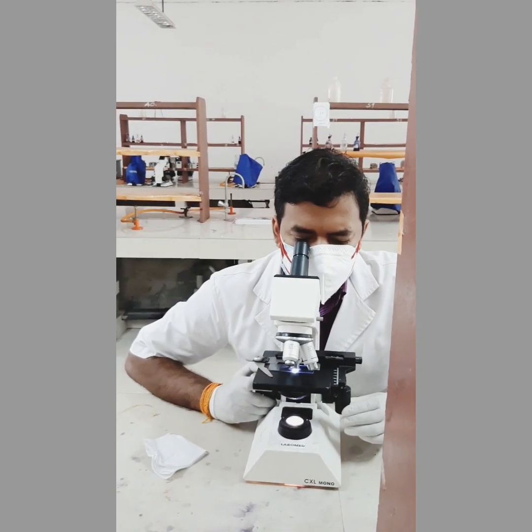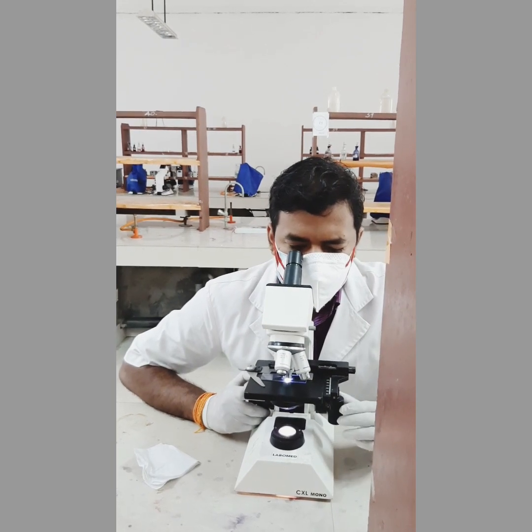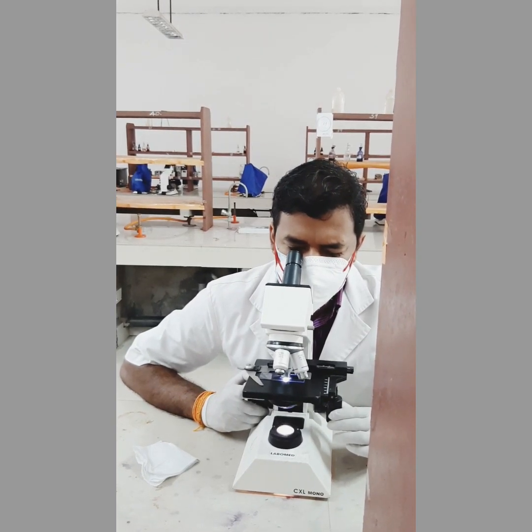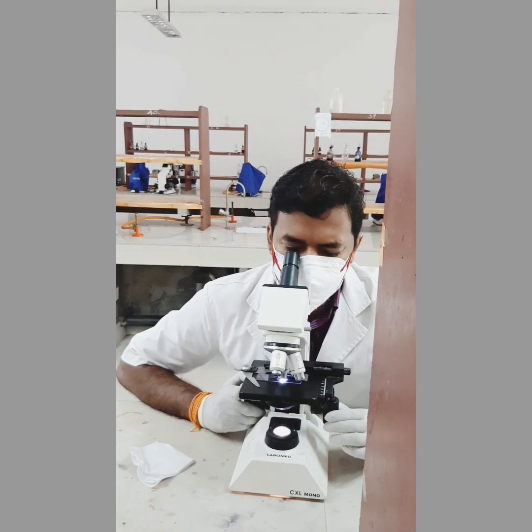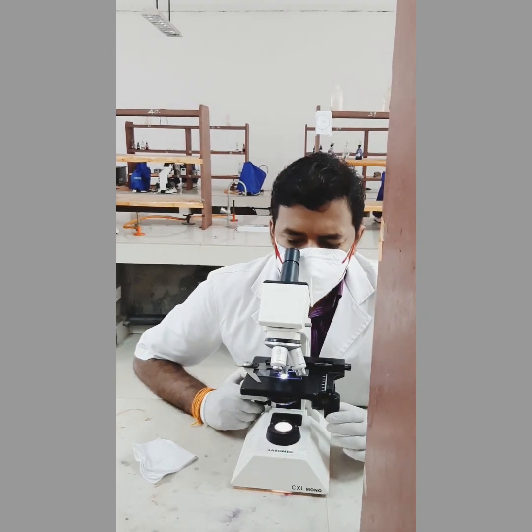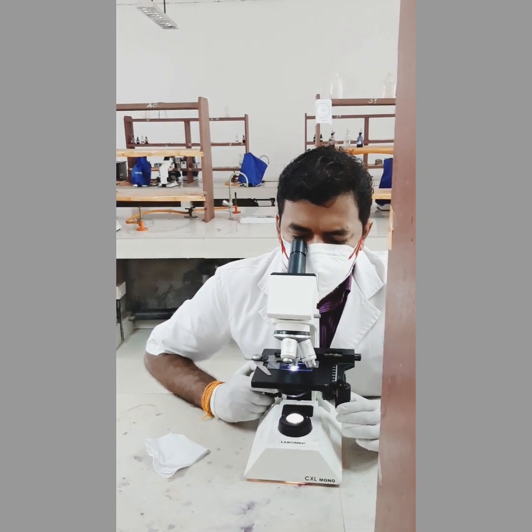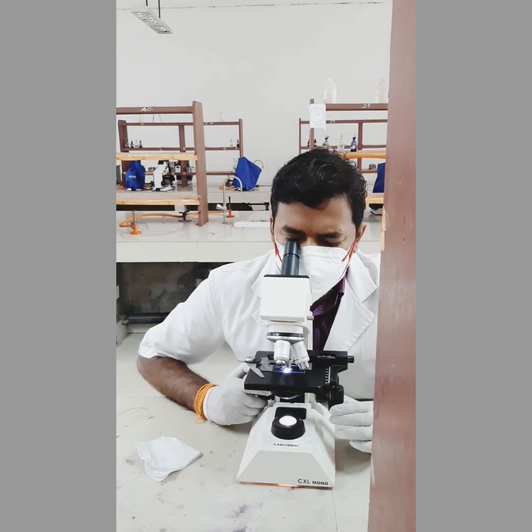It is not as easy as gram staining. In gram staining we use a culture smear. Here we are taking direct sputum, the sputum sample of the patient. So first you have to focus the blue background. Then you have to search for the pink color rod-shaped bacilli. These acid fast bacilli are long filamentous bacteria, not like the usual bacilli.